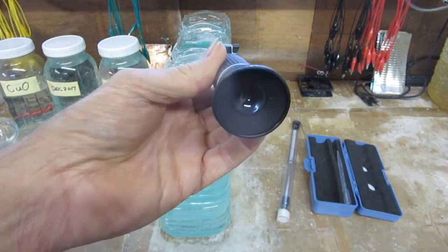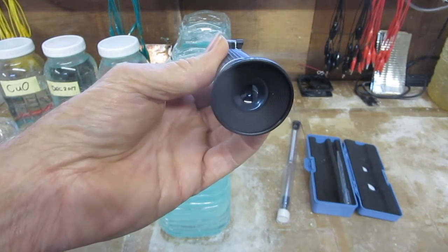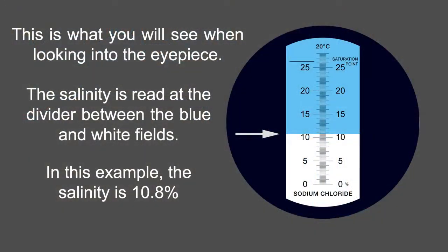Now I'm going to pause the video for a second, and I'm going to put up a graphic so you can see this scale. This is what you will see when looking into the eyepiece. The salinity is read at the divider between the blue and white fields. In this example, the salinity is 10.8%.